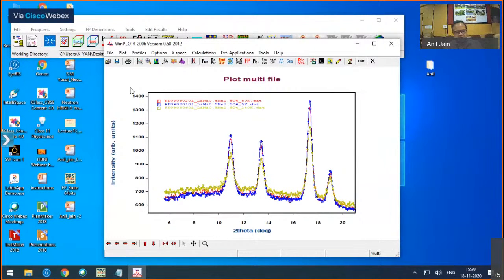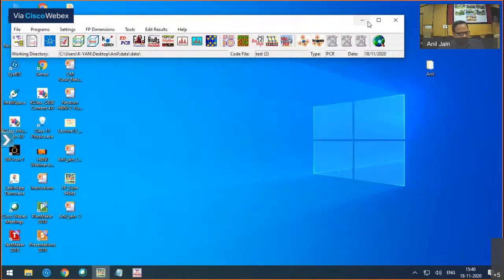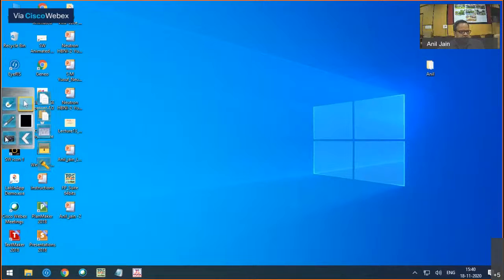Now the best is to go to low temperature and then try to understand the magnetic structure, or you can see the temperature evolution of the magnetic structure also. So here we have the additional peak, and the idea is now to determine the magnetic structure of this compound. Let me quickly remind you how we define the magnetic structure in the FullProf notation, and what the steps are which are involved to determine the magnetic structure.